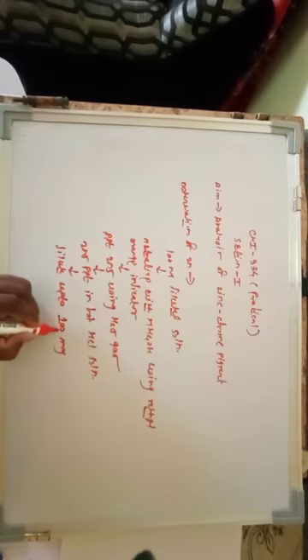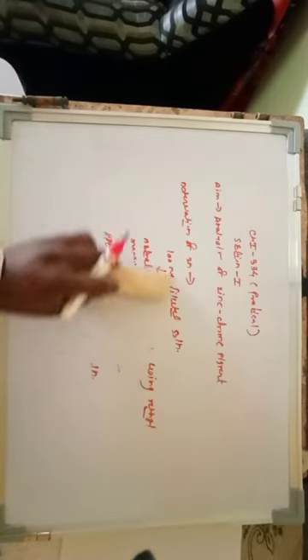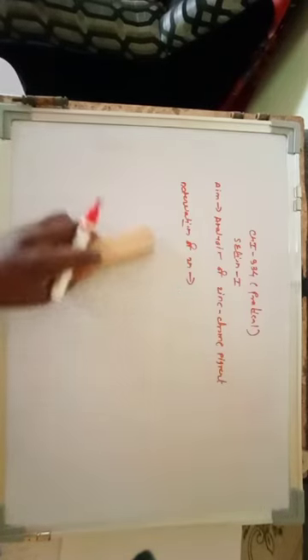So you take the original diluted solution, neutralize with NH4OH, precipitate zinc as zinc sulfide using H2S gas, dissolve it in acid and dilute up to 100 ml. The next procedure is very simple, that is determination of zinc by complexometry using ethylenediaminetetraacetic acid, EDTA, solution.